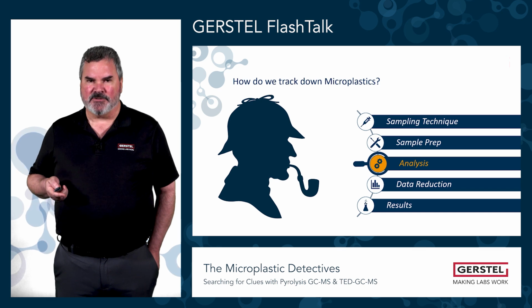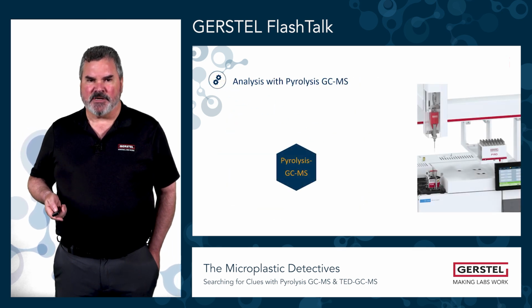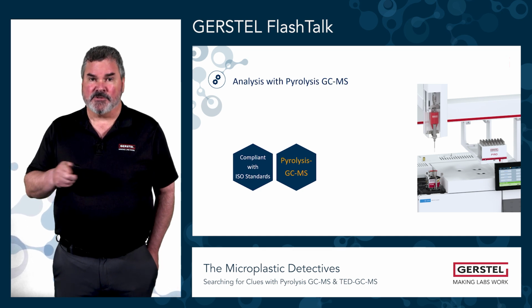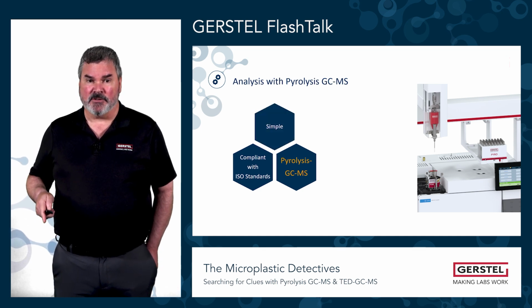And again, that comes down to either using Pyrolysis GC-MS. In pyrolysis, the process is going to be compliant with ISO standards. There's also an ASTM standard using pyrolysis on this, by the way.